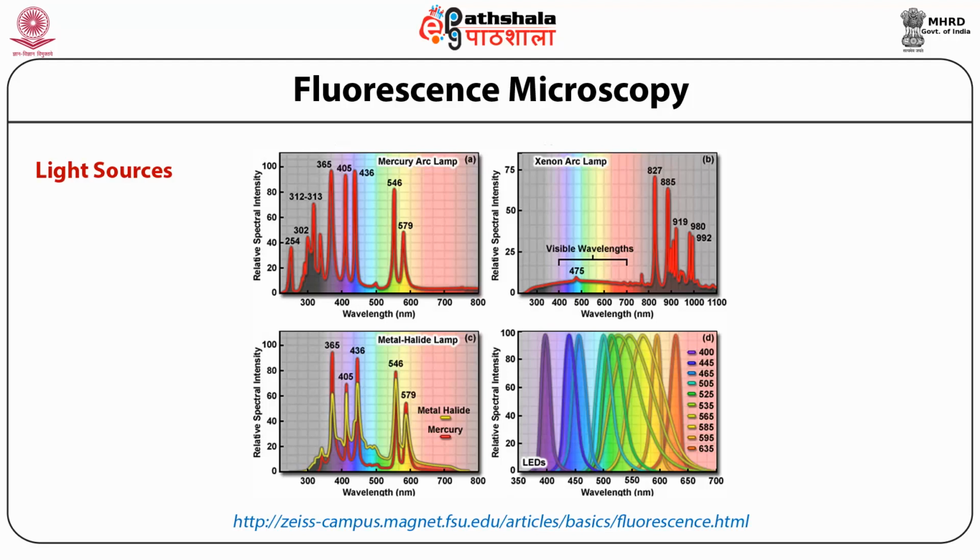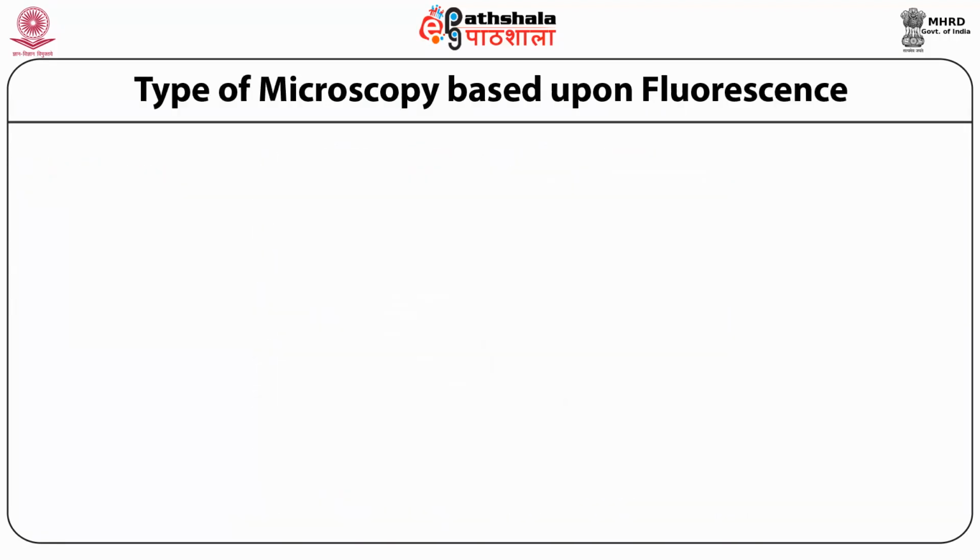Only the emission filter assembly is required, because instead of using the filter assembly on the microscope, we just have an additional filter wheel on the LED light source, which automatically eliminates the rest of the undesired wavelengths and lets only a specific wavelength illuminate or excite the samples.